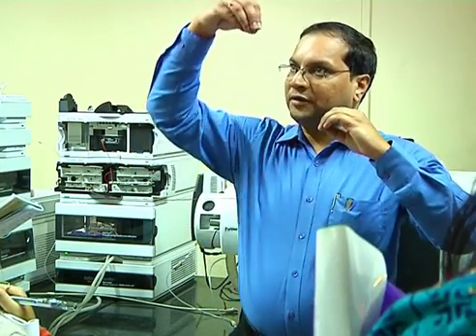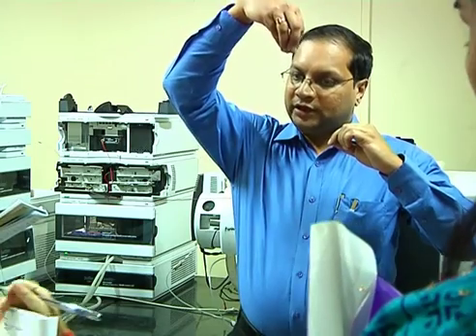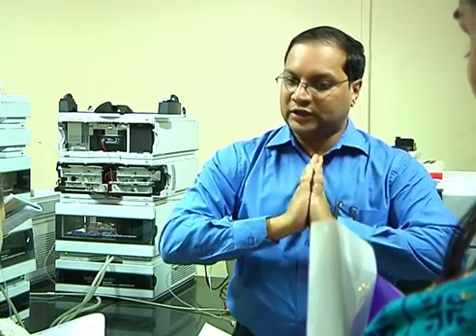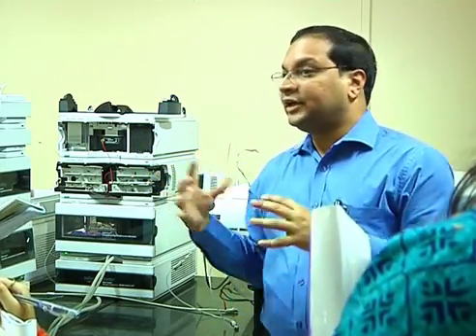What is being done here is a stream of liquid, then a nebulization gas, which is nitrogen. The liquid is sprayed like a perfume spray, something like that. You push gas around that nozzle so that it gets sprayed off. You have split the stream of flow into a small spray, and the source is heated typically at 300 degrees centigrade.